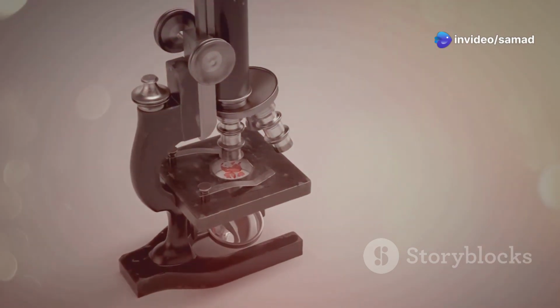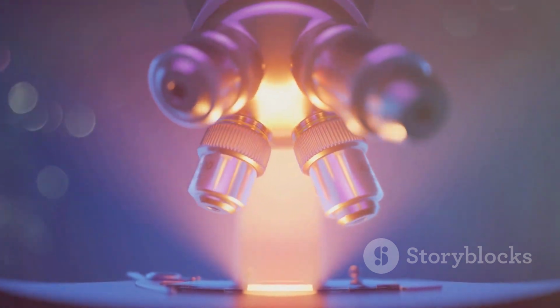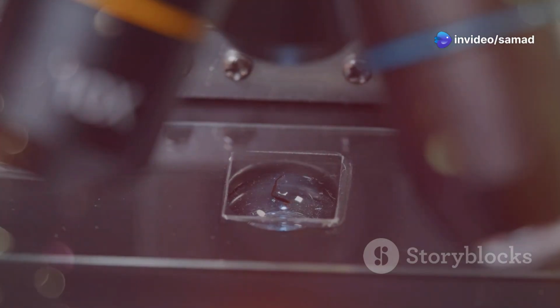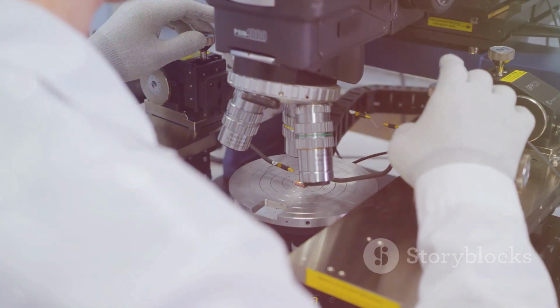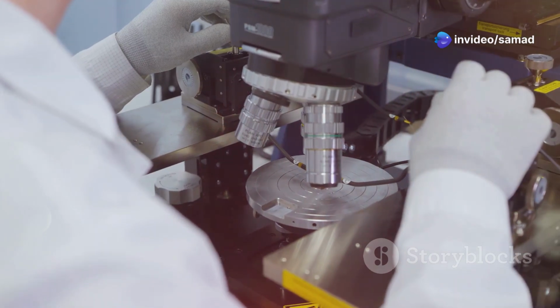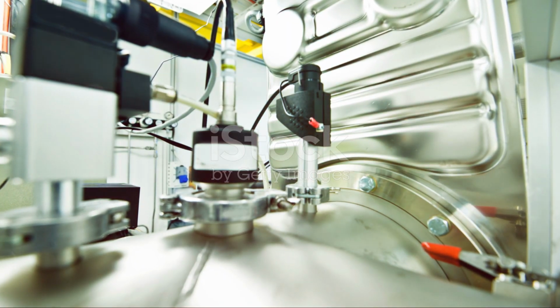The journey into the heart of matter begins with understanding the limitations of traditional light microscopes. These instruments, while valuable for observing larger structures, rely on visible light to illuminate specimens. However, the wavelength of visible light limits their resolving power, making it impossible to discern objects smaller than a few hundred nanometers. This is where electron microscopes step in, offering a window into a realm far beyond the reach of light. By harnessing the unique properties of electrons, these remarkable instruments have unlocked a universe of knowledge hidden within the microcosm.